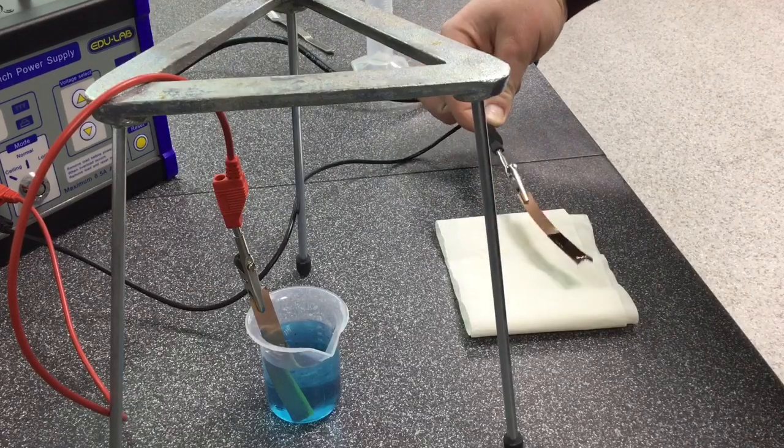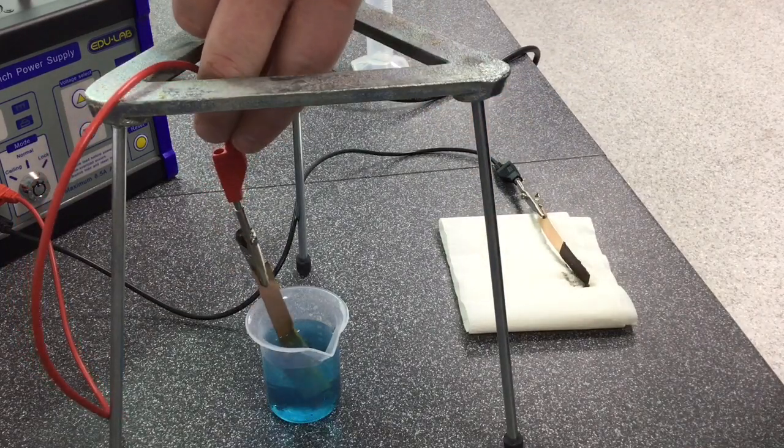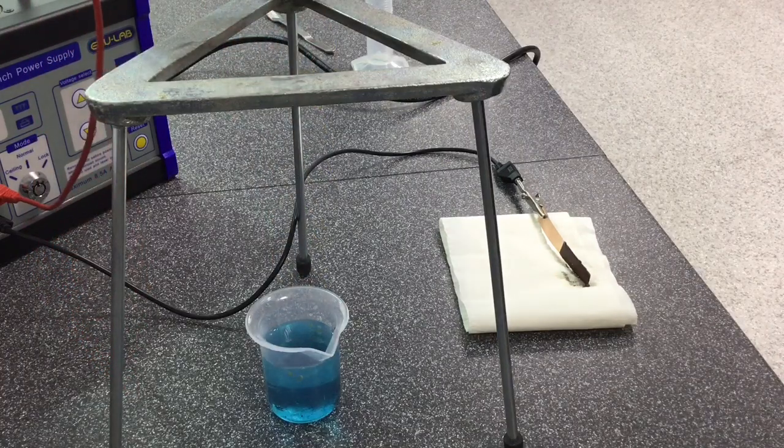However it is evident that the cathode has gained some mass whilst when you remove the anode represented by the red wire you can see that this has reduced in mass slightly.